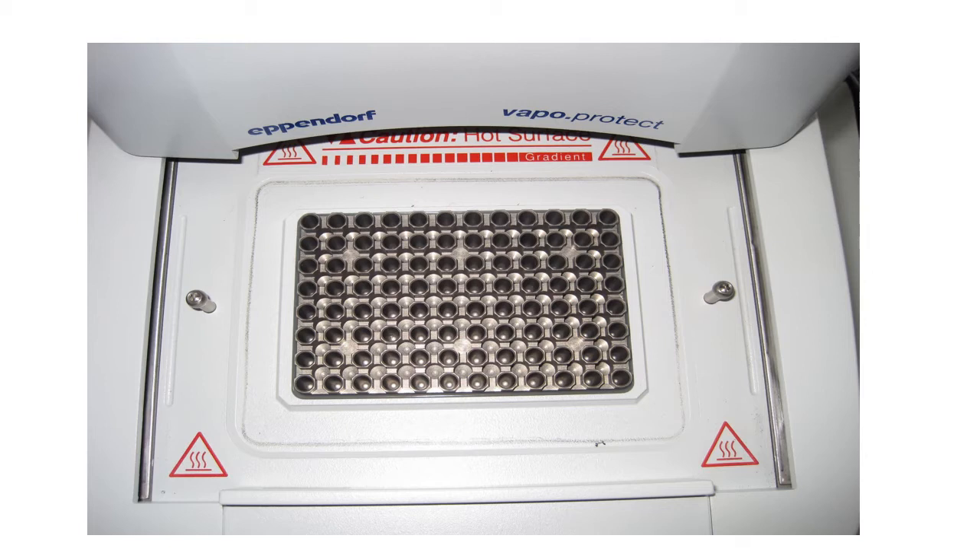We were shown the reaction wells. Into these wells goes a PCR reaction mixture tube, which should be of even thickness and smooth wall surface to ensure heat is transferred evenly.